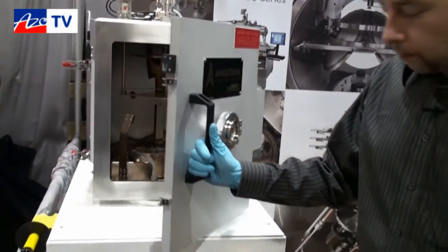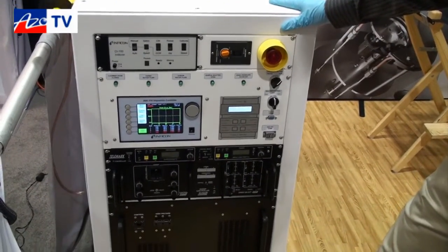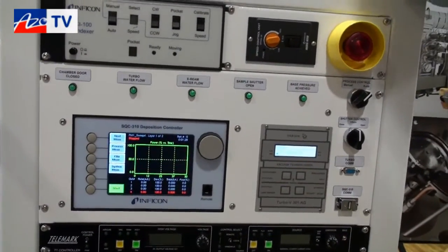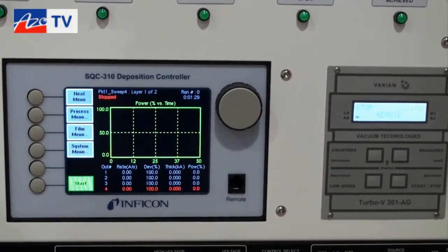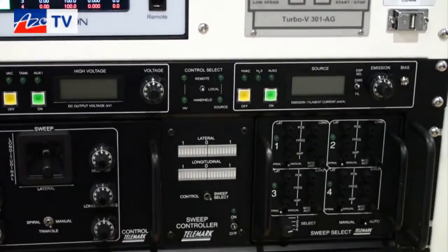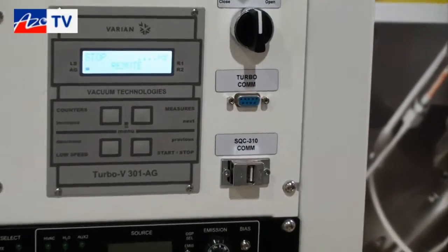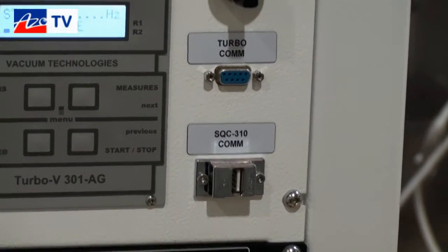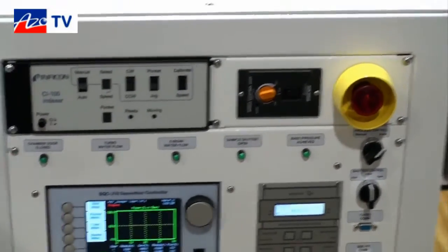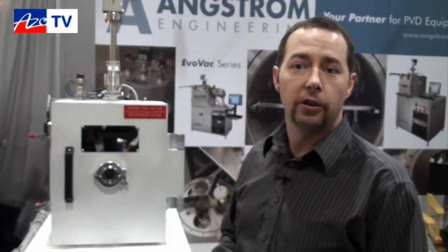The control system uses an Inficon SQC 310 controller, which provides a lot of flexibility for controlling ramp rates. It allows us to automatically index the pocket on the electron beam system to run multiple layer films all in one recipe. On the back of the controller there's a USB port routed to the front of the system, allowing you to connect a laptop. That laptop lets you run the included PC software to build your recipes, execute your recipes, and store and download your data — then bring it back to your office to crunch the numbers.